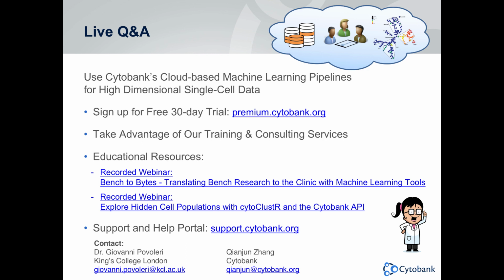And of course, the antibodies and all the reagents are the same that we always use. So for each study, we keep the same batch of antibodies and reagents. That's what we do.